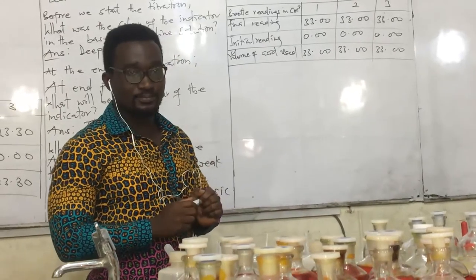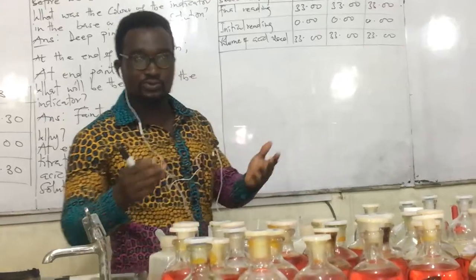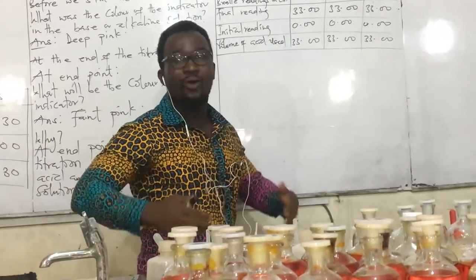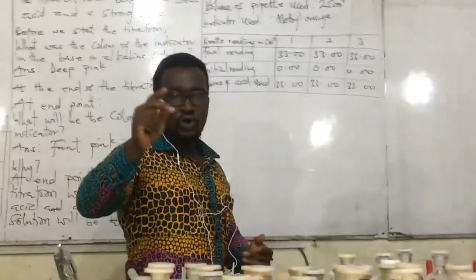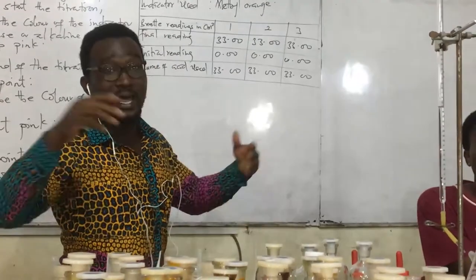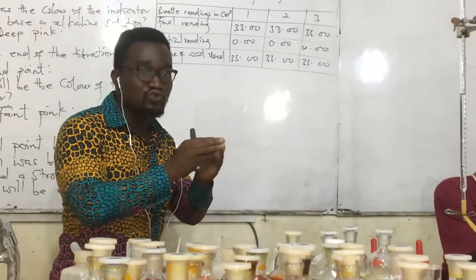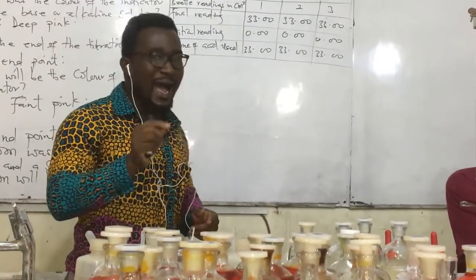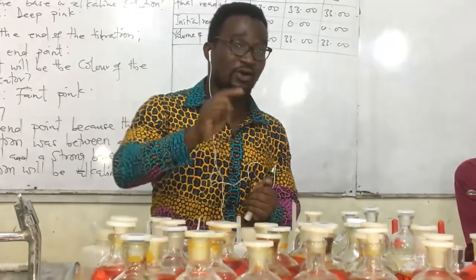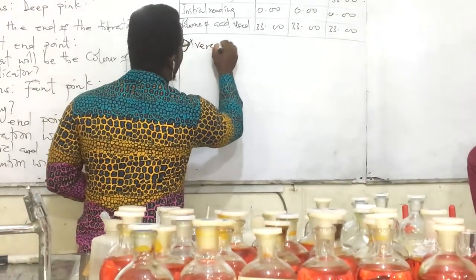We are supposed to calculate the average titre. The first one, I did not do it because I knew we were going to do this one too. So it will be the same idea. We want to pick values that are consistent. I told you earlier from our theory that if you have three values that are very consistent, you pick them. The average means the mean. So you pick the three. If you have only two that are consistent, you pick only two. Remember, the consistency we are talking about, I said the difference should be plus or minus 0.2, plus or minus 0.1.